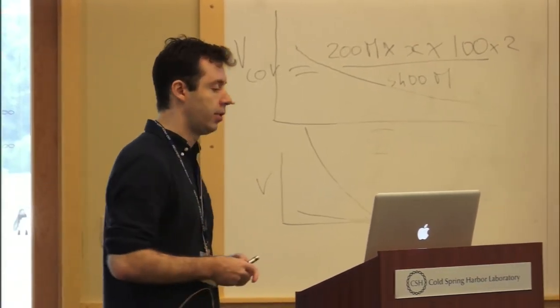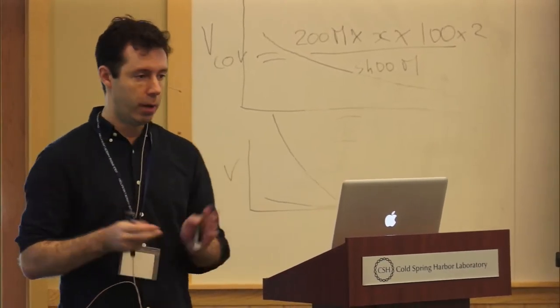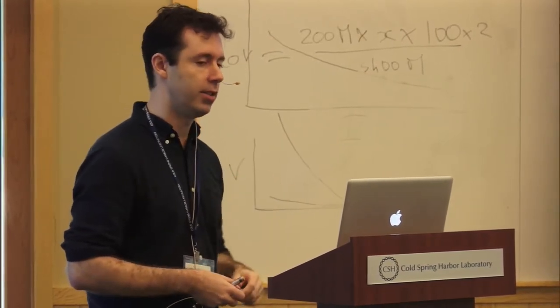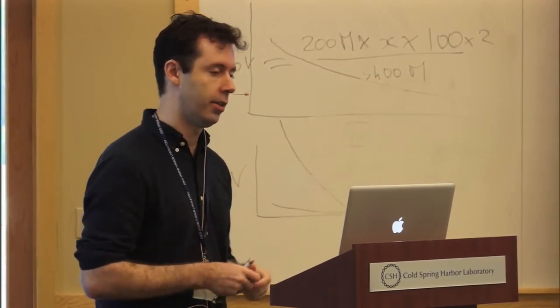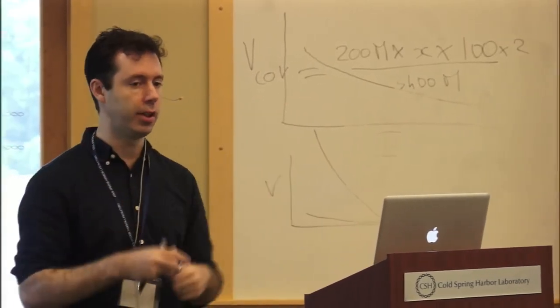But in RNA-seq, typically what you want to do is measure the number of reads. You want to measure clonality. You want to do some additional QC. But the coverage in RNA-seq is not something that is used too often as a measure of quality or target, again because of this high disparity in expression level between genes.